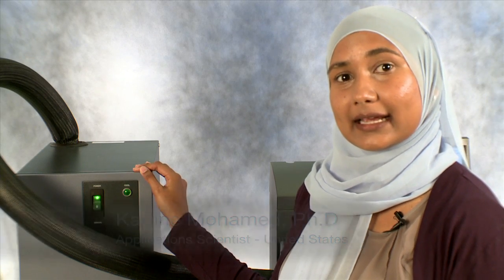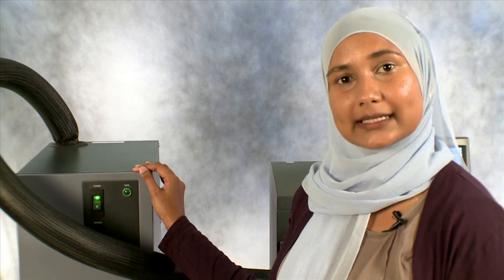In this TA Tech Tip, I will demonstrate how to reinitialize the RCS coolant accessory and the DSC gas supply to the DSC after the instrument has been sitting idly for some time.